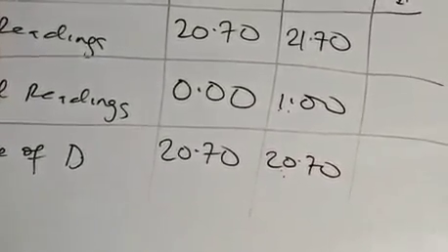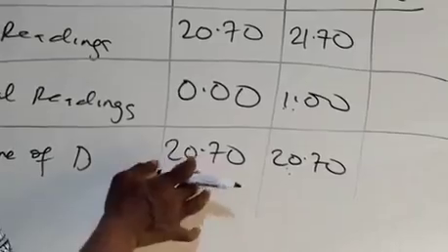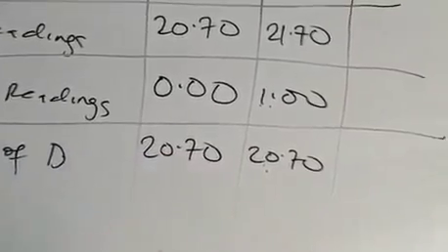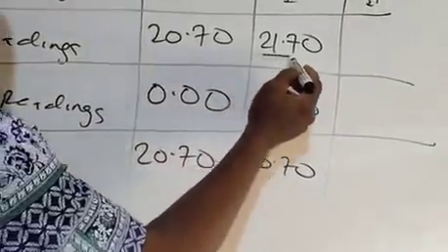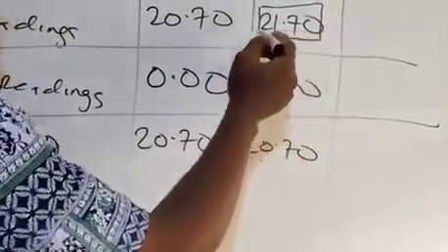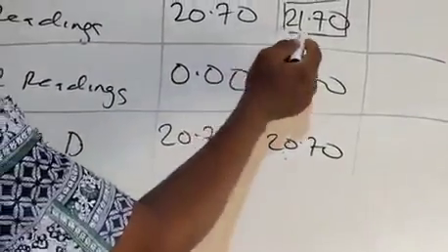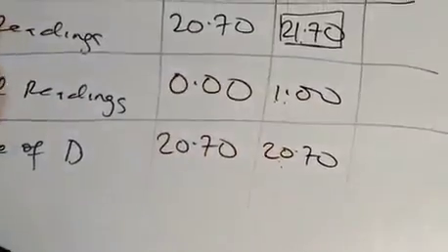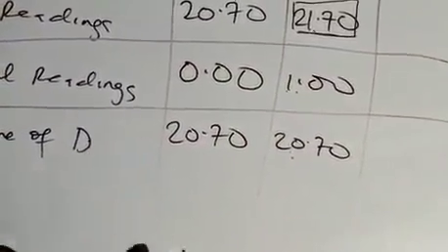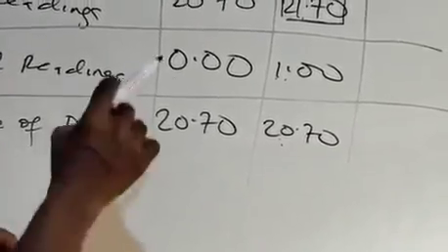You run the titration speedily because you know where the endpoint lies by virtue of doing this one carefully. So you run the acid speedily to 21.70. But you will not reach 21.70 because it must definitely change before 21.70. So you run it to the whole number before this value. The whole number before this is 21. Run it to 21. So when you reach 21, you now take it drop by drop. You must surely change between 21 and 21.5.